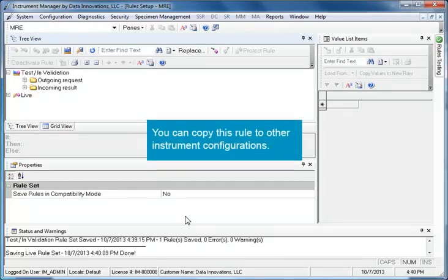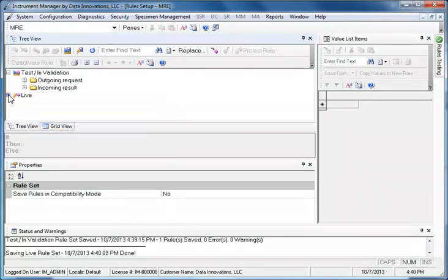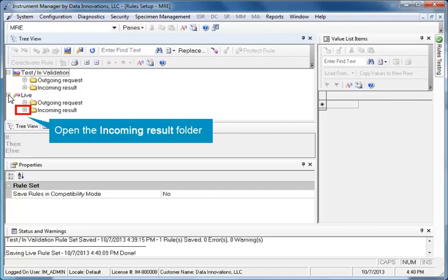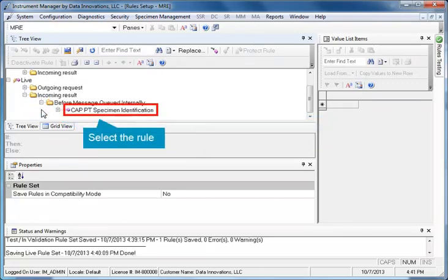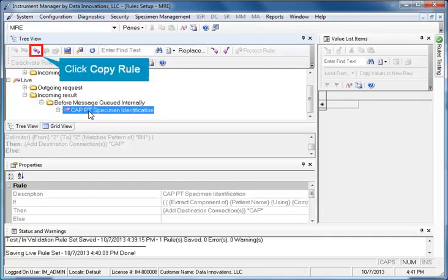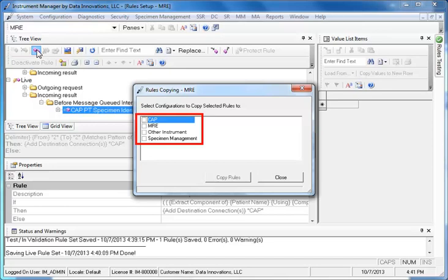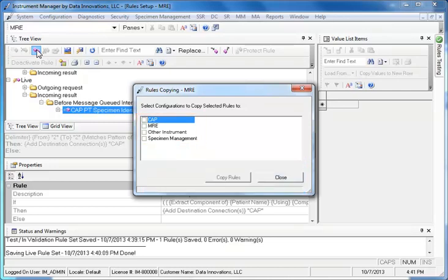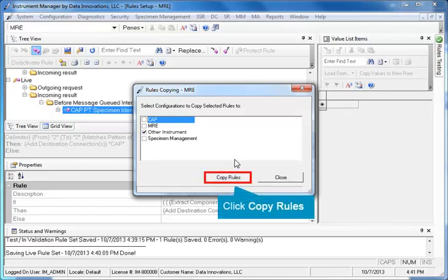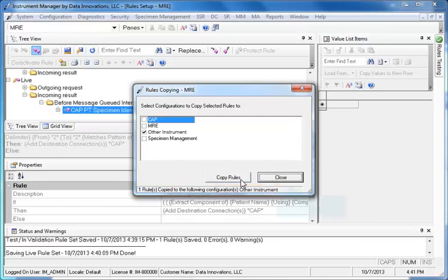You can copy this rule to other instrument configurations. To do this, open the Live folder in the tree by clicking its plus sign. Open the Incoming Result folder, then open the Before Message Queued Internally folder. Select the Rule, then click the Copy Rule button in the toolbar. A window opens showing a list of available instrument configurations. Check the configuration to which you want to copy the rule. In this example, we'll check Other Instrument. Click the Copy Rules button. A message appears at the bottom of the window confirming that the rule was copied. Click Close.